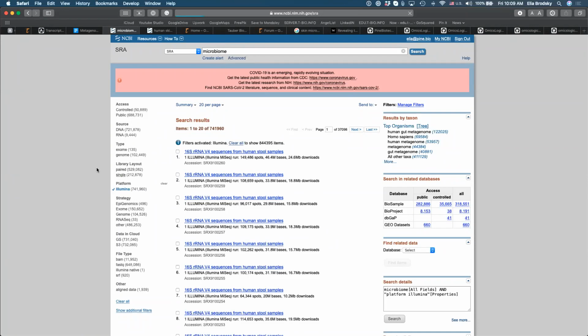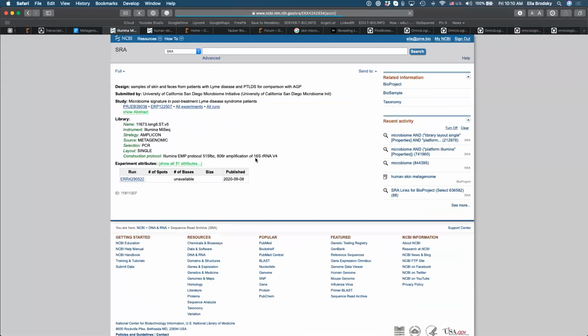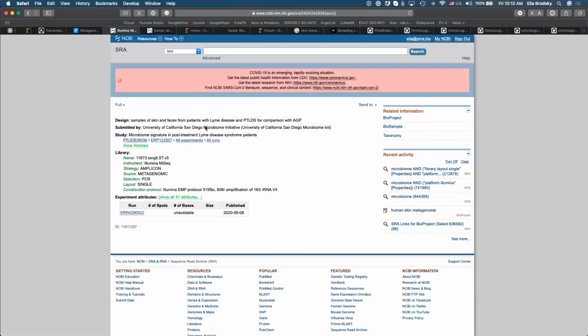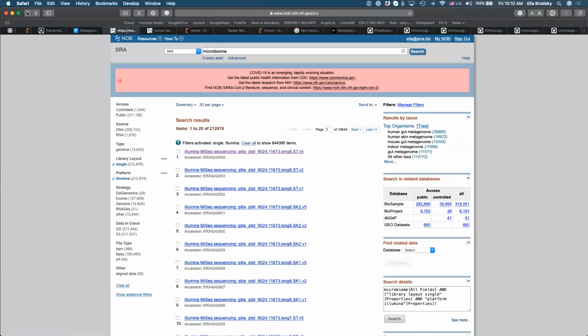Obviously, if you go for the single ones, you can see samples of skin. Let's see. Okay, yeah, this is amplification of V4, even though it is single.